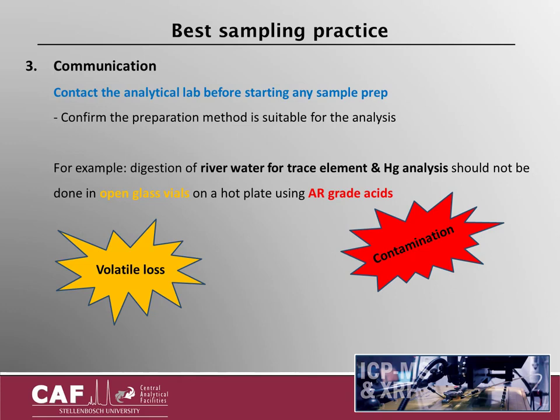Once you've contaminated your samples, nothing can be done afterwards. You cannot take the contaminants out. It's not ideal to subtract blanks, so make sure you do not add any contaminants during the sample processing.